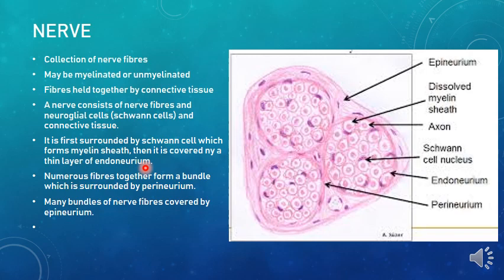The endoneurium is a connective tissue made up of delicate collagen fibers, formed by fibroblast cells. On higher magnification you will see very delicate collagen fibers as well as fibroblast nuclei. At light microscopy level, the endoneurium shows the nuclei of fibroblasts, but you can't distinguish them from the nerve fibers separately on low magnification. Each nerve fiber is surrounded first by myelin sheath, and then by the endoneurium.